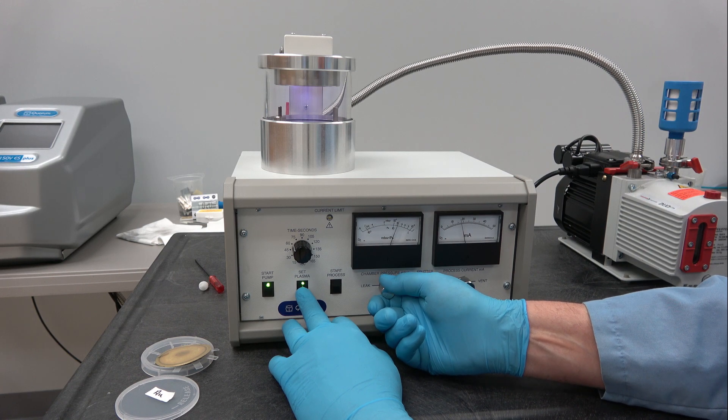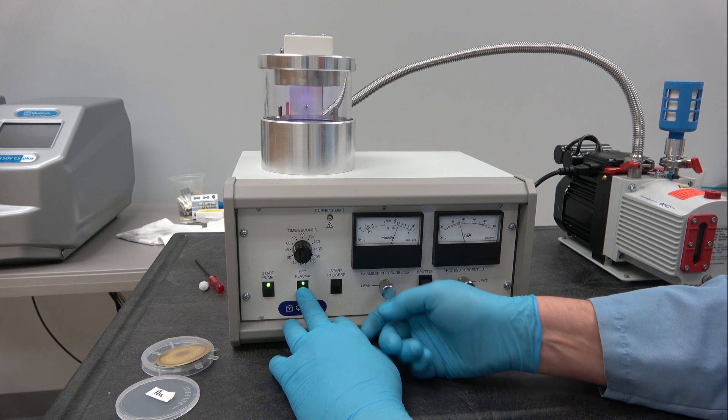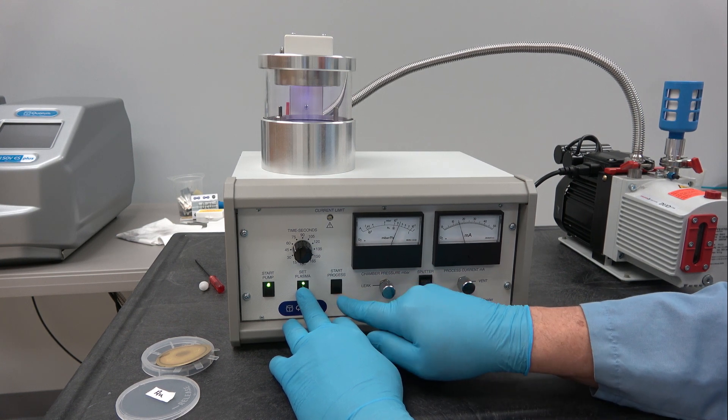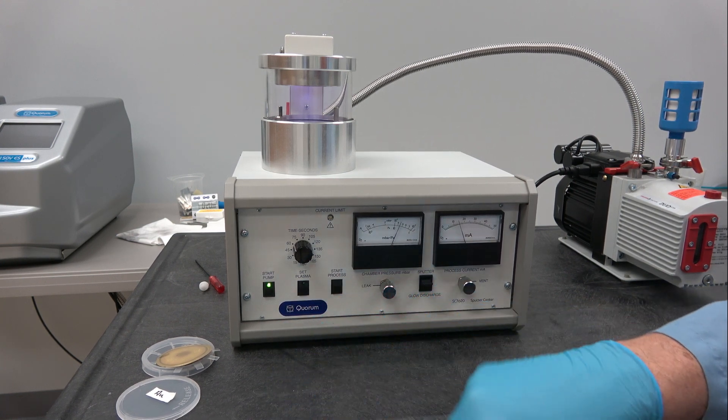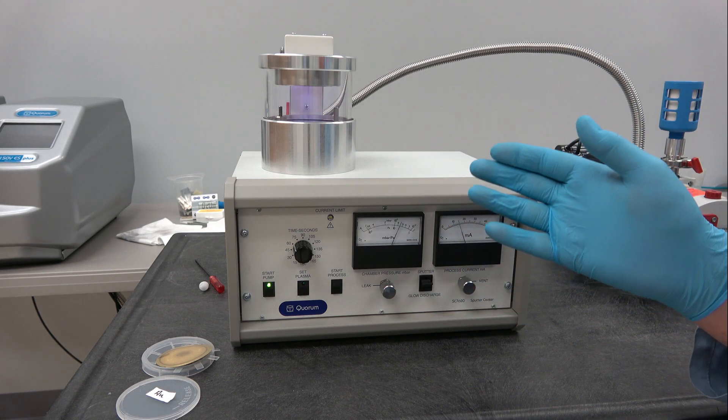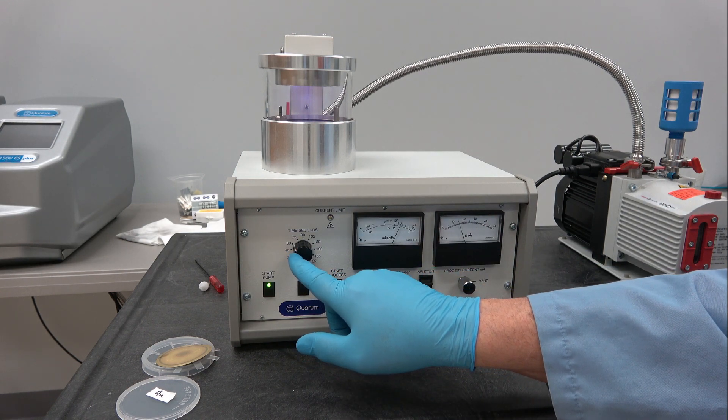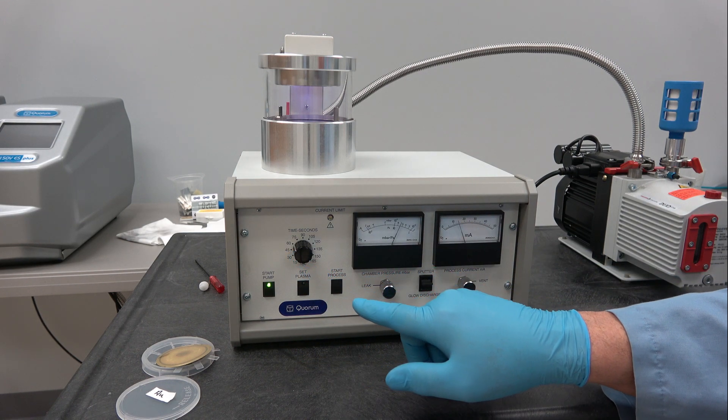So we'll just set it to 15. And once it's at 15, we can hit start process. And it will maintain the sputtering for whatever value you have set on the timer. In this case, I think 60 seconds.